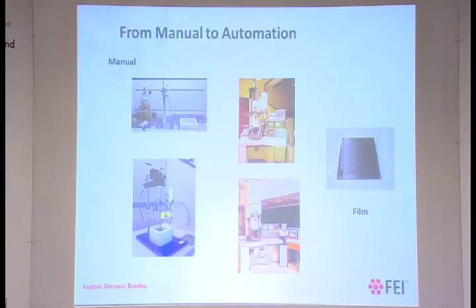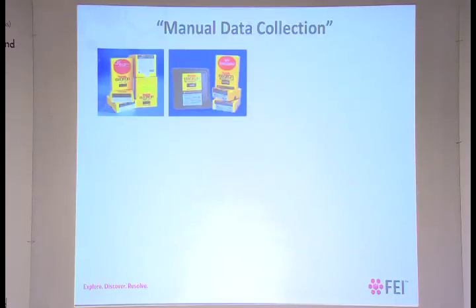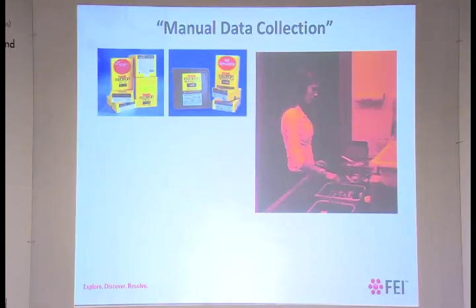We would then collect those images on film. A film cassette would only contain something like 56 of these films, so we would only have 56 images per cassette. So in a day, the maximum we'd have is 112. And still we couldn't see what we actually took a picture of, because what we'd have to do once we collected all these films, here's the film that we used, was to go into a dark room like this lady has done, develop the film, fix it, wash it, leave it to dry, and then we would have our negatives.